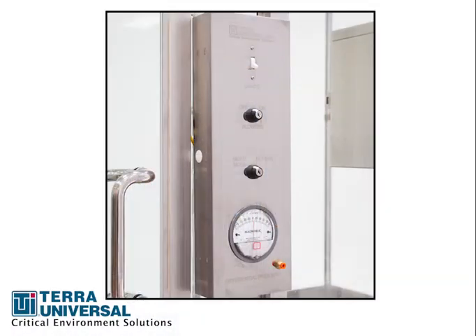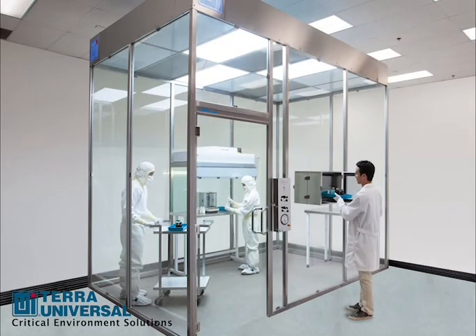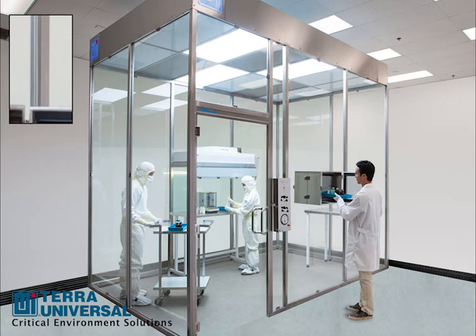A pressure gauge monitors room conditions, and key lock switches ensure secure control of night service, lighting, and fan filter unit operation. As built, the room holds positive or negative pressure to accommodate a variety of aseptic applications. However, wall panel seams may be caulked to meet CGMP or other requirements.